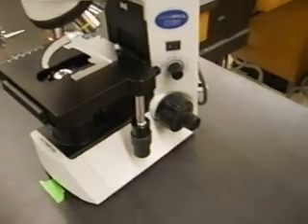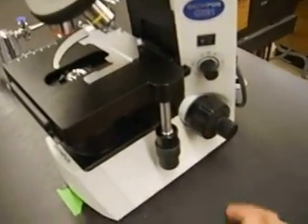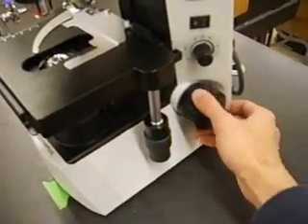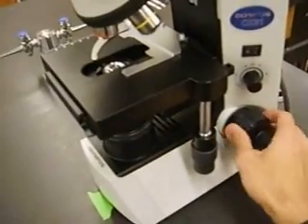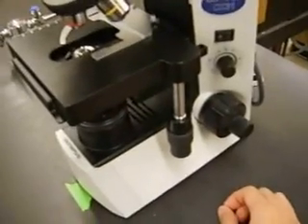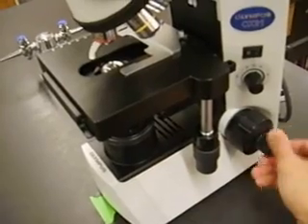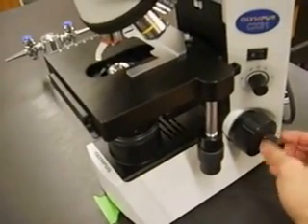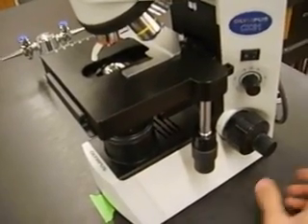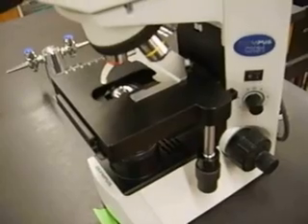A couple more things you'll use a lot this quarter: one knob adjusts the intensity of the light, and then there are the focus knobs. There are two sets of focus knobs — the coarse adjustment knob at the base moves the stage up and down, and the fine adjustment knob at the tip also moves the stage up and down, but in very small amounts you can barely see with the naked eye. There's a proper time to use each, and we'll show you that in a moment.